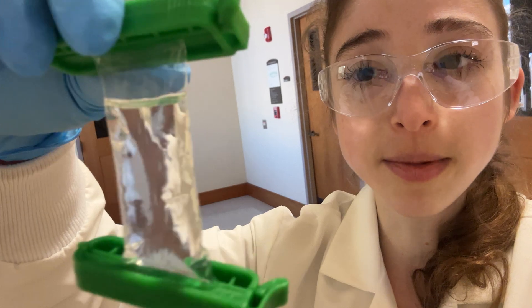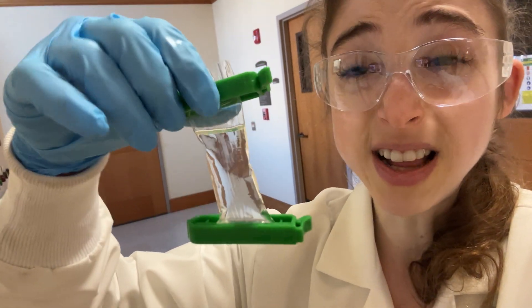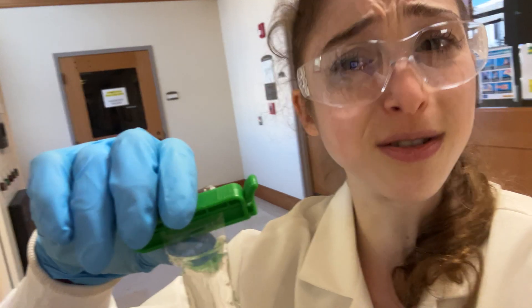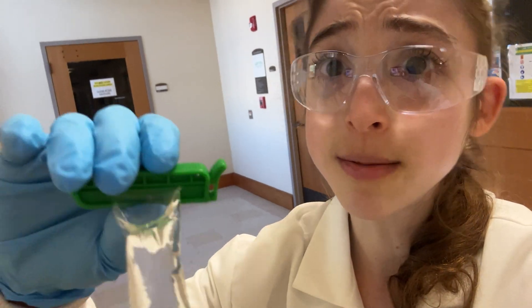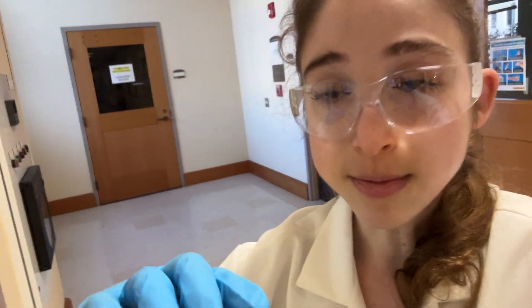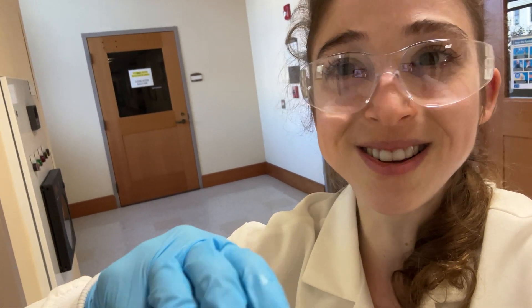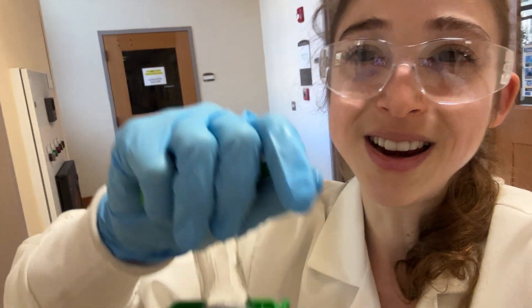Hopefully we'll come in tomorrow, our protein will be nice and soluble and happy, we'll run a gel, do an enzyme activity assay, and freeze this guy. Fingers crossed - it's always scary the first night, like please don't crash. Huge congrats to Nicholas for his first protein purification and doing a super duper awesome job. I can't wait to see that gel. I haven't done protein purification in a couple of months, but in grad school I did it all the time - except then we were using fancy machines. Here we're doing it more old school, which is fun.